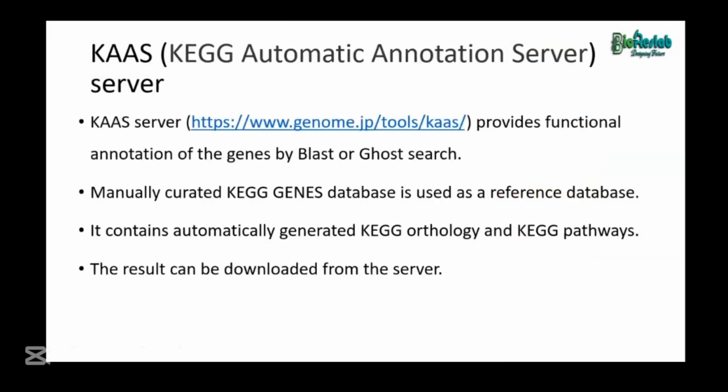Right. The other one is the KAAS server. So this is the KEGG Automatic Annotation Server, as we don't have access to the KEGG database freely. So we cannot access it without paying money. But the KAAS server is still available free for everyone.